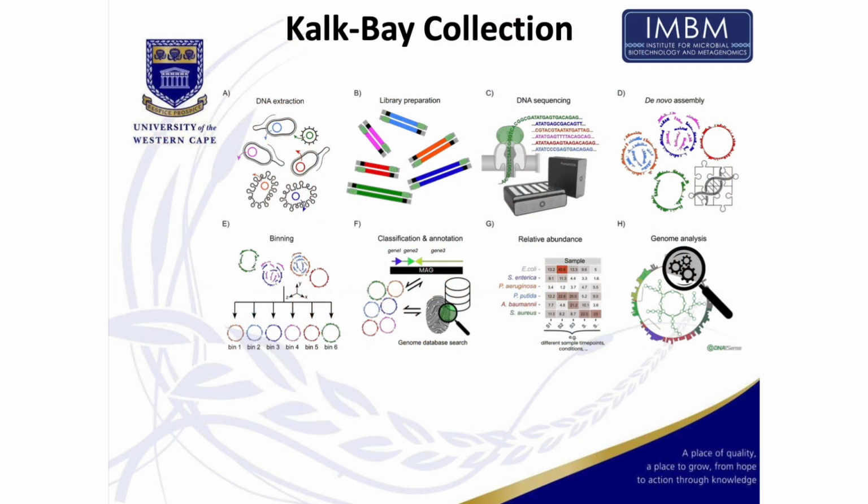Okay, so going beyond the biobank, or not really. Rob explained this earlier, this is just a different way of doing that, and that is metagenome assembled genomes, where we grab an environmental sample, extract all the DNA, sequence everything, and now in software, computationally, we try to piece together the microbial genomes.